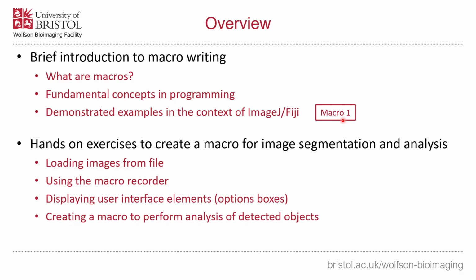The second part of this course, Dom will be taking you through a worksheet which allows you to apply these processes and principles that you've seen in this video into creating your own macros. So starting relatively straightforward, loading images, using the macro recorder to identify functions, then going through generating graphical user interfaces or basic dialog boxes so that if you were to give your macro to someone else, they'd be able to use it and control it without having to edit any of the fundamental code.